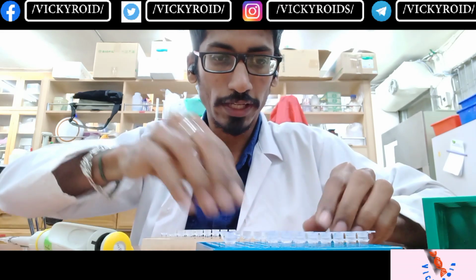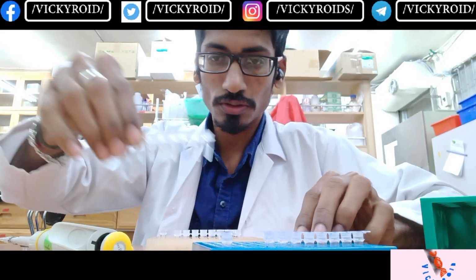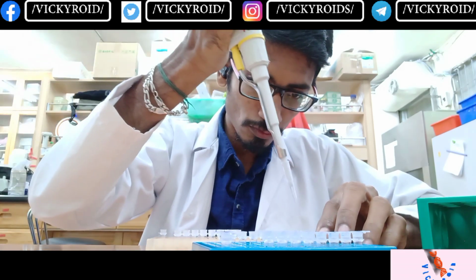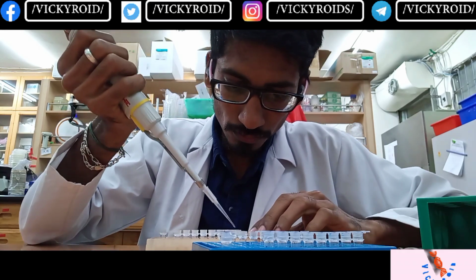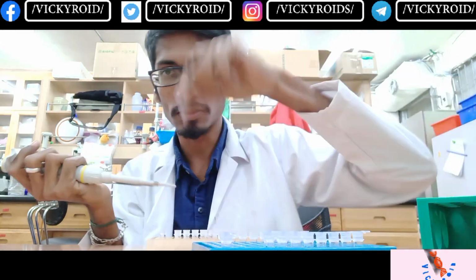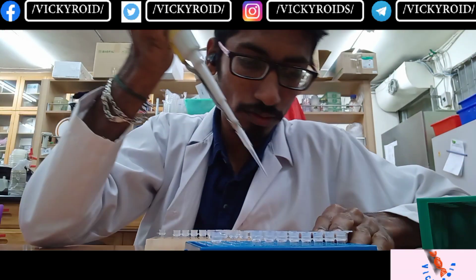So I have said 2 microliters, so I'm just going to take DNA from each tube and apply it to all the tubes. I have taken the samples from 1 to 8 and I'm going to add to tubes 1 to 8. While adding the DNA to the tube, you have to add it at the periphery so that it gets in. You have to be assured that you are adding to the right tube.